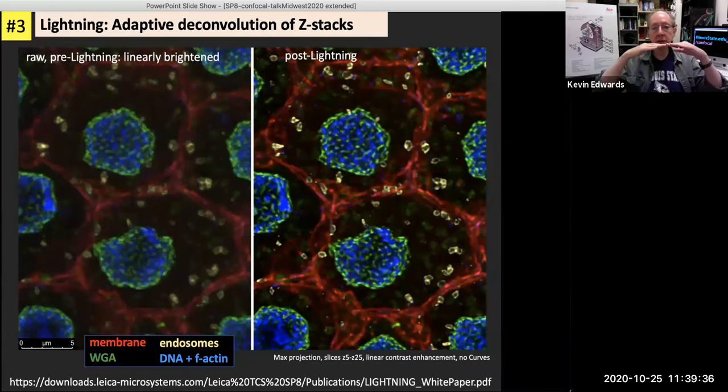But it turns out there's a bit more information as you move from slice to slice, as you go through the depth of the sample. There's also information there on where the photon is really coming from. In any light microscopy system, photons will tend to spread out, and it can be hard to see exactly where they were coming from if you just look at a single slice.